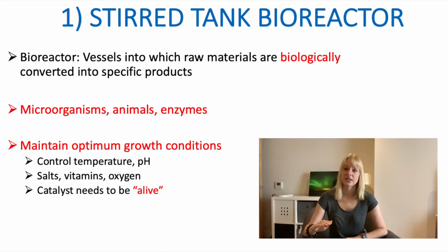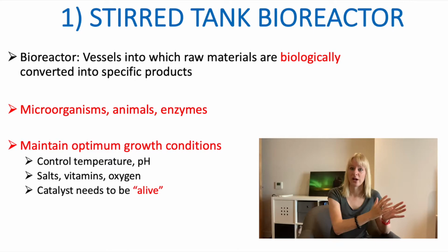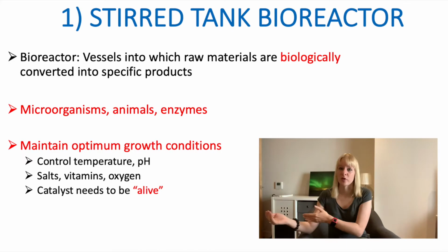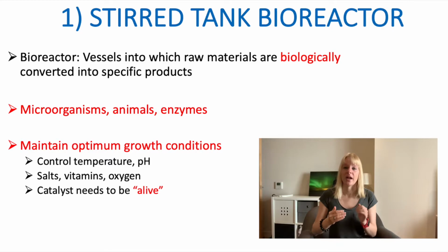And the difference with a normal reactor is you can have a bad batch for a while, but obviously you change the conditions and it starts working again. What the difference is here is that your microorganisms are killed off and you can't produce the next batch. So you have a much narrower window in which you can operate, and you need to really take care of this.